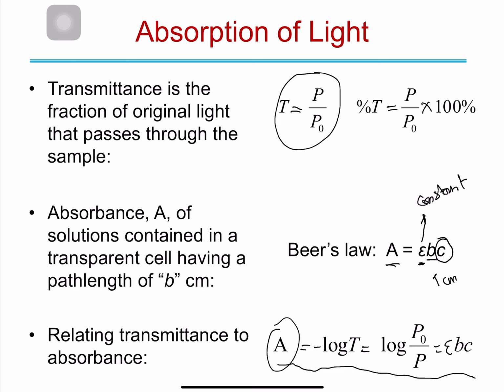In the spectrophotometer, the result that you see on your screen is the absorbance. So basically what happens is that the spectrophotometer will measure the difference between the irradiance of the light irradiated and the light that comes out from the sample solution. And this is expressed as the absorbance. We don't see the transmittance, but you see the absorbance as your value. This is because the Beer-Lambert law is a relation between the absorbance and the concentration.